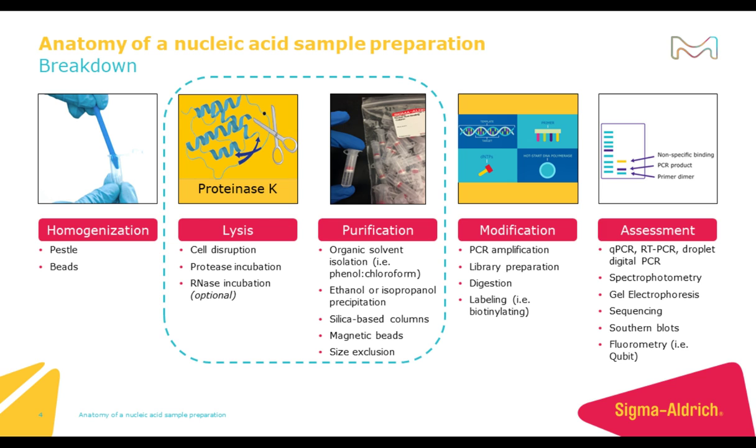There are now methods where scientists will amplify their nucleic acid by PCR directly after lysis. However, for unbiased assessment, results from a purification step is still required. Most scientists group lysis and purification together for sample preparation, as many off-the-shelf products exist to address these needs.